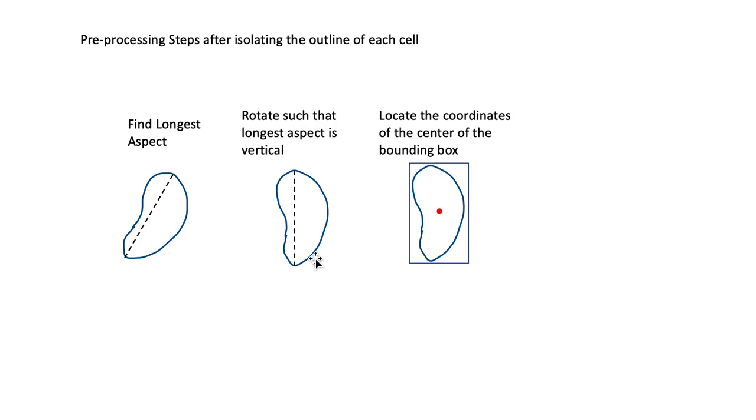An important detail to know is that after we isolated each fiber particle, we oriented it such that the longest internal length was vertical, and we did this because it cleans up the data. Because nature is inherently polar, when we align shapes according to those poles, we get cleaner data.